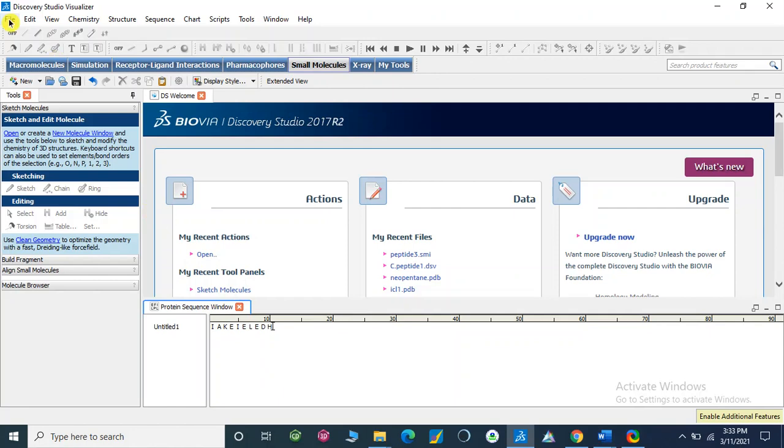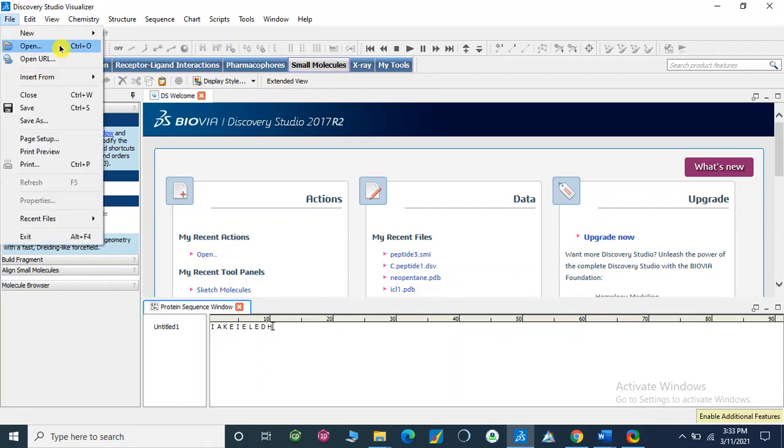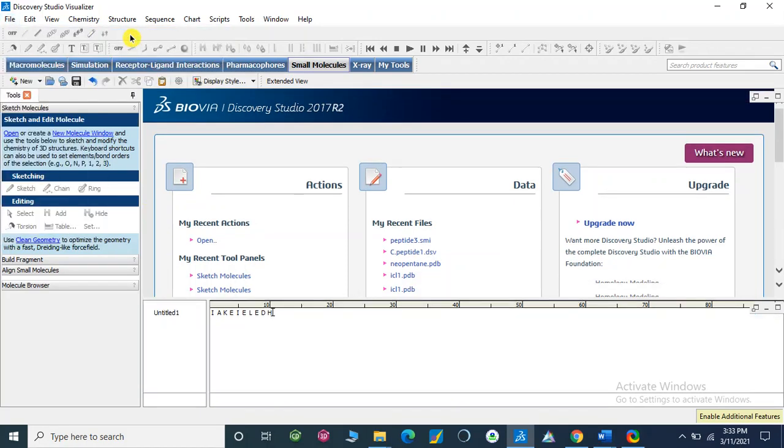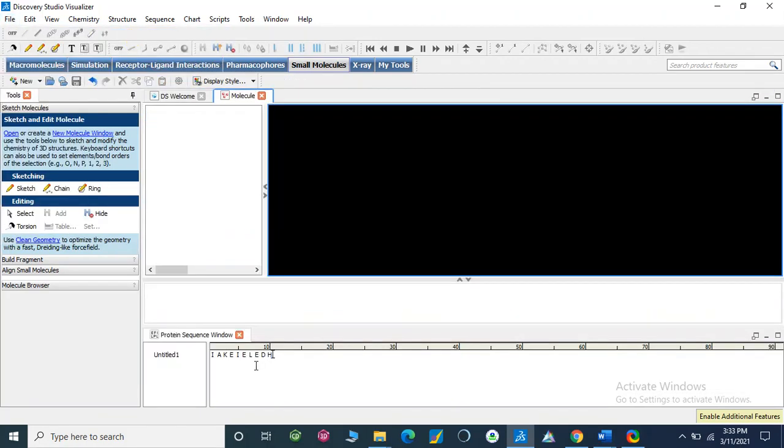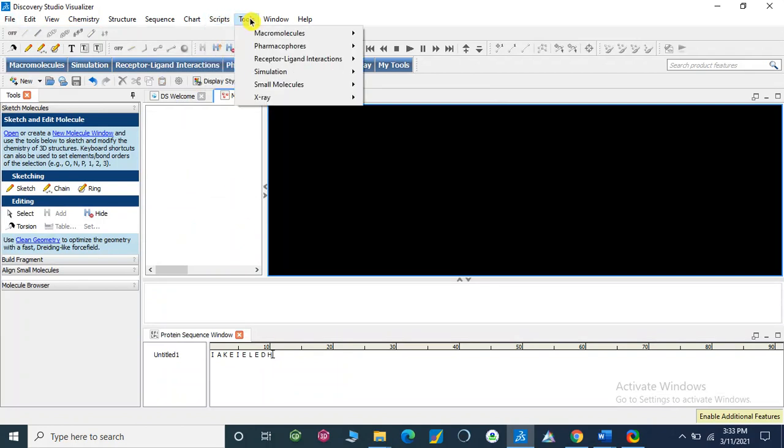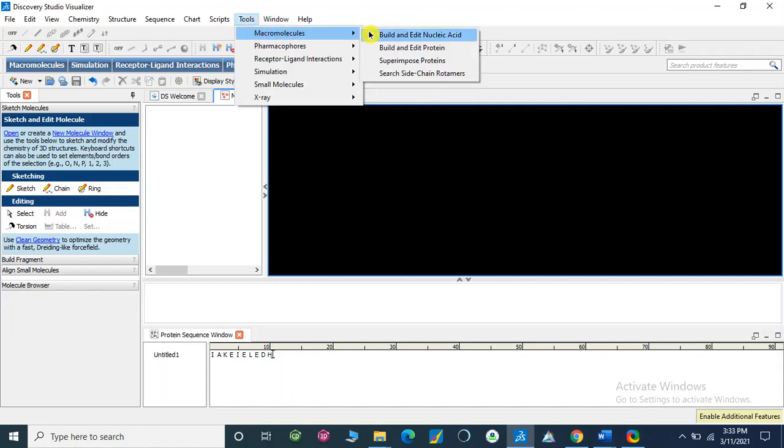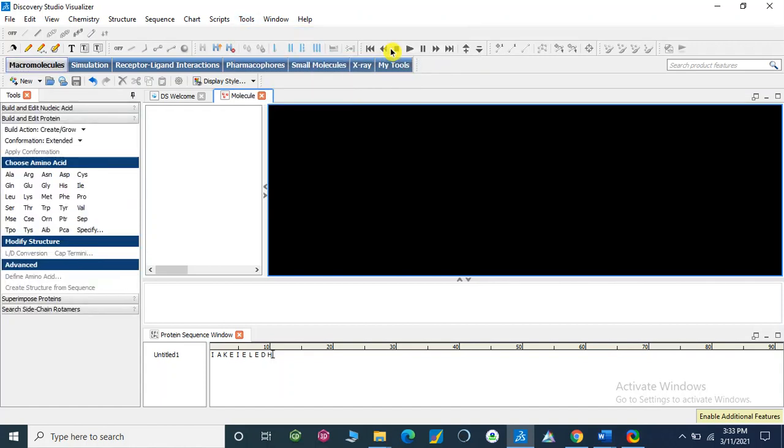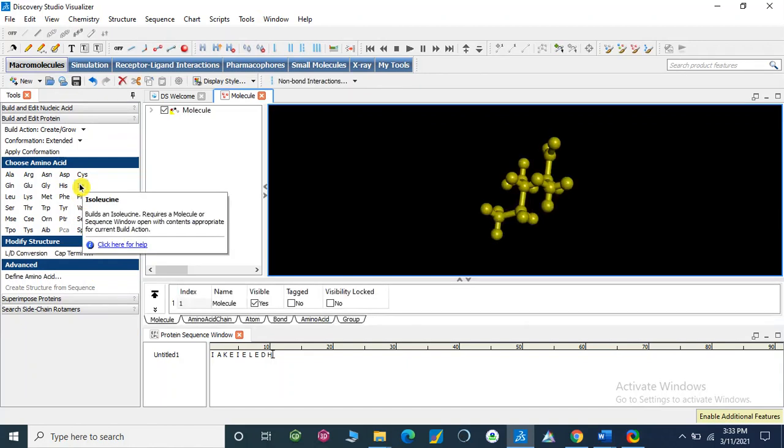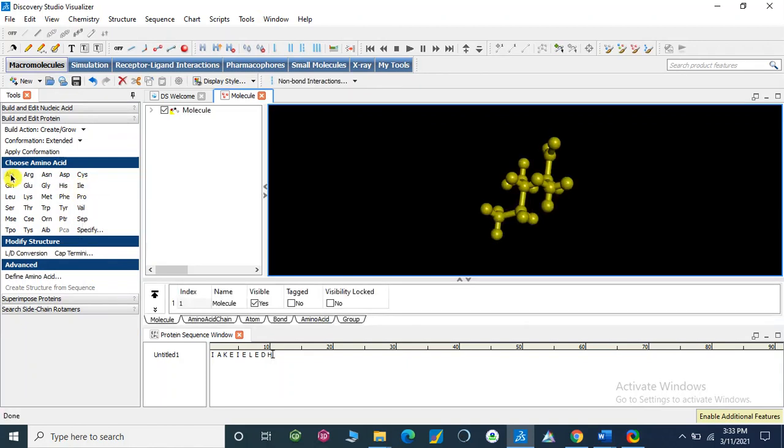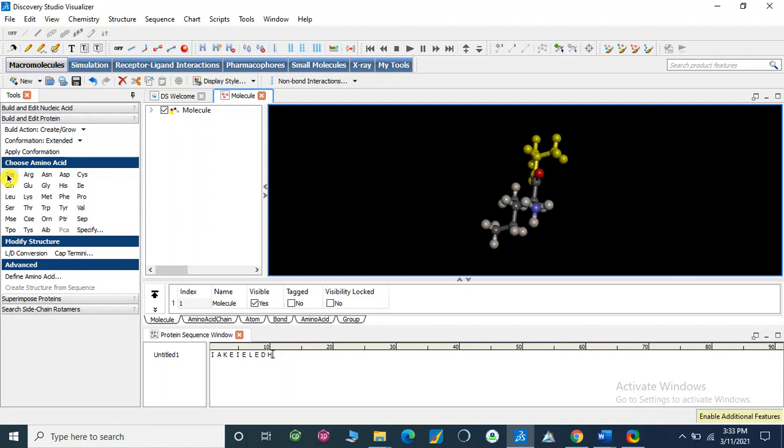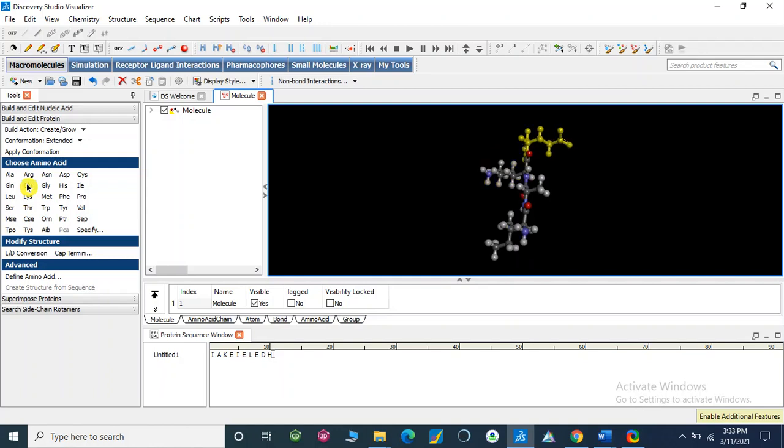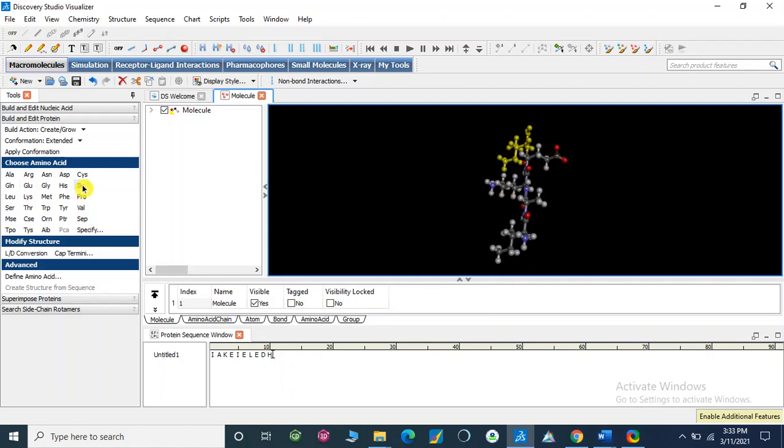Now open new molecular window. I am going to make a macromolecule one by one, build and edit protein. Go to Tools, Macromolecule, Build and Edit Protein. Our first amino acid sequence is isoleucine, then alanine, then lysine (K represents lysine), then glutamate, then isoleucine. In this way we can build a sequence of amino acids here.